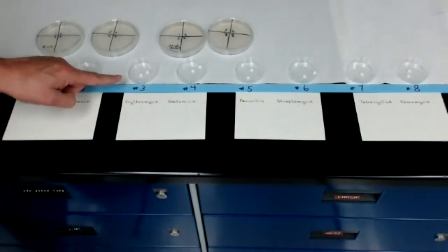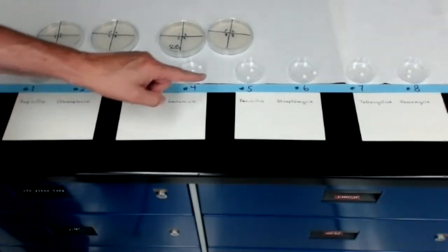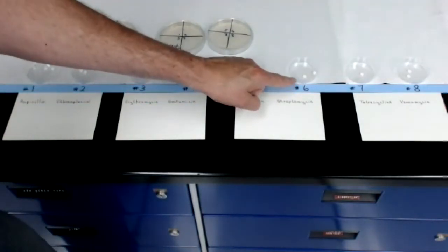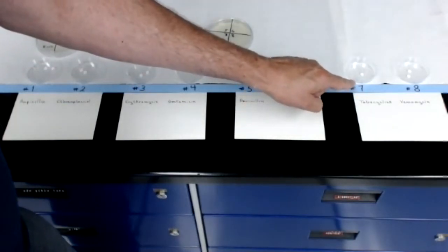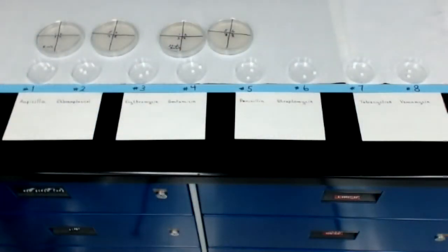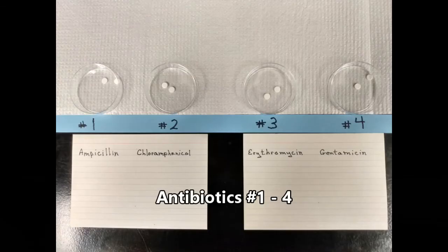Number 3 dish has erythromycin discs. Dish 5 has penicillin discs. Dish 6 has streptomycin discs. Dish 7 has tetracycline discs. And dish 8 has vancomycin discs. 8 different antibiotics distributed among 8 different dishes.